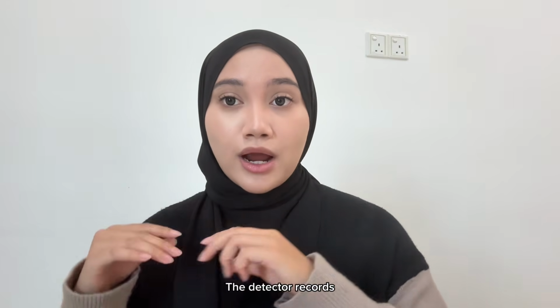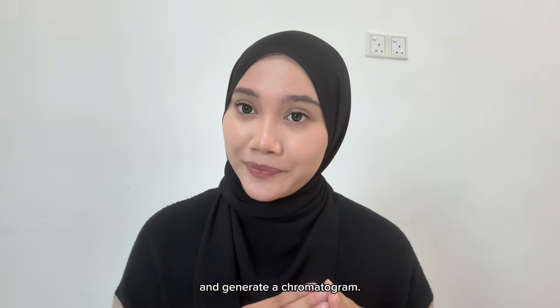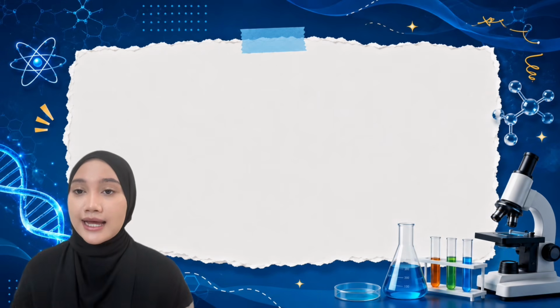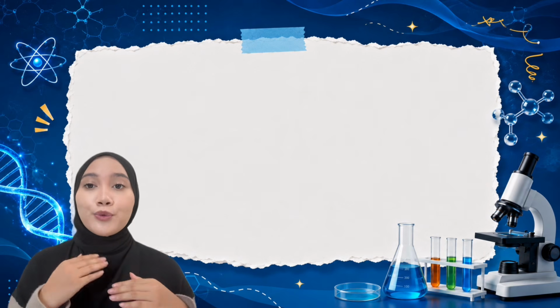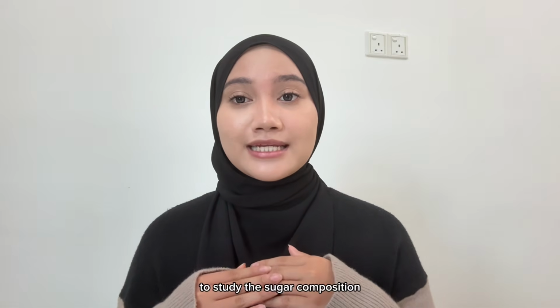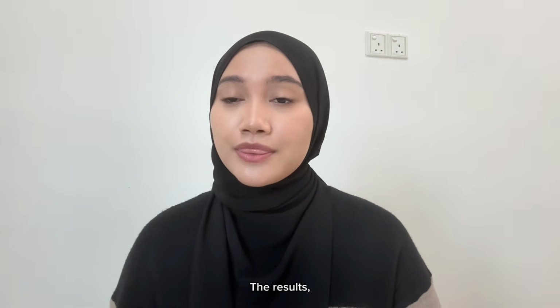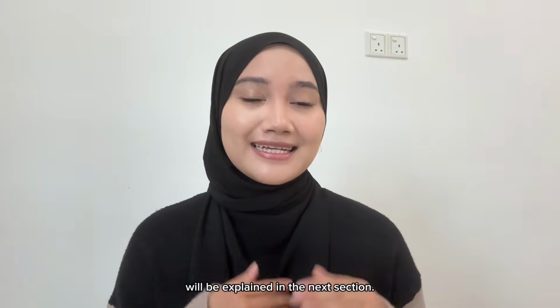The detector records the separated compounds and generates a chromatogram. Each peak represents a different sugar. The retention time identifies the type of sugar, while the peak area indicates its concentration. Finally, the chromatogram obtained can be compared to study the sugar composition of apple juice and orange juice. The results, interpretation, and concept will be explained in the next section.